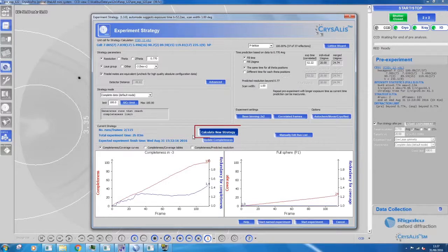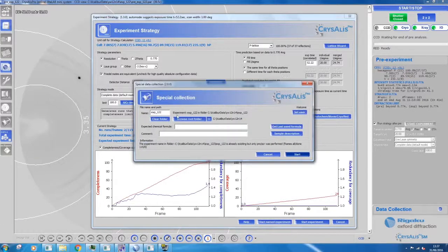Press calculate new strategy if you have changed anything on the right-hand side of the screen. The total time will change automatically if you change the exposure times. If you are happy with the strategy, start by pressing start named experiment.